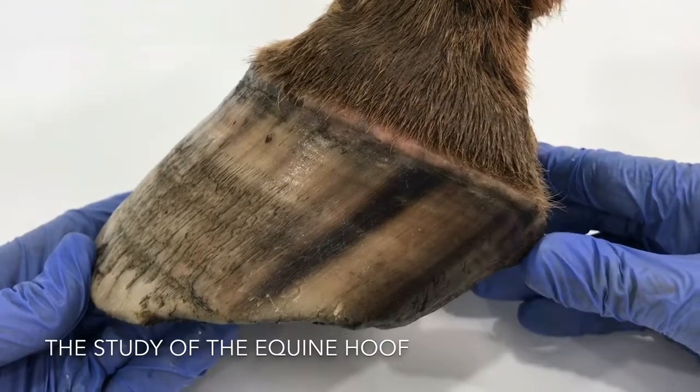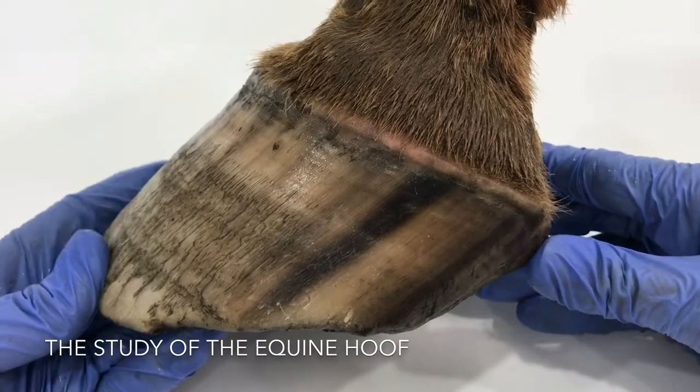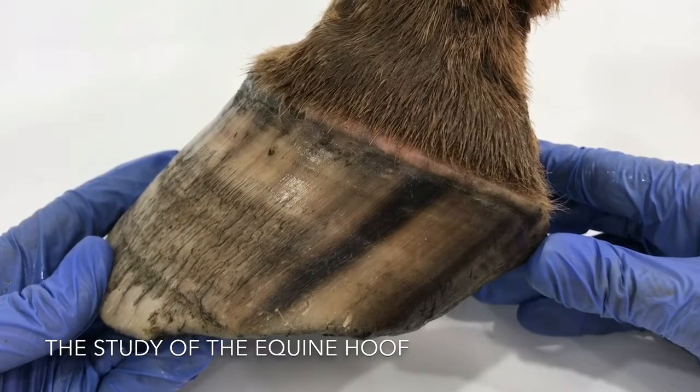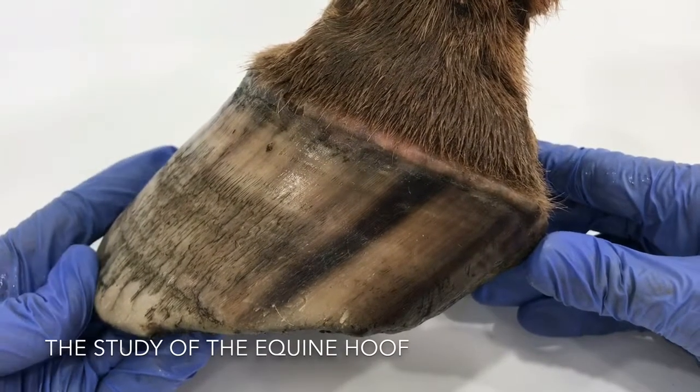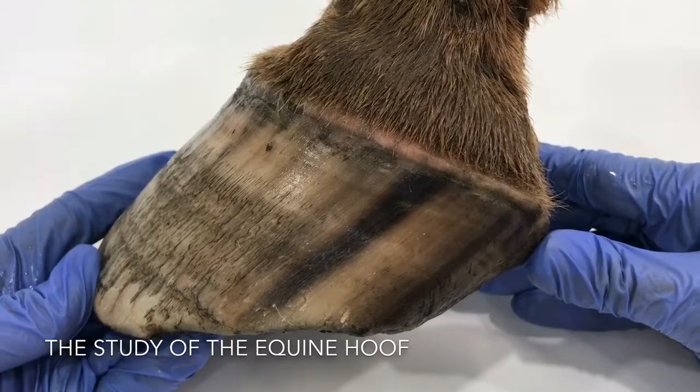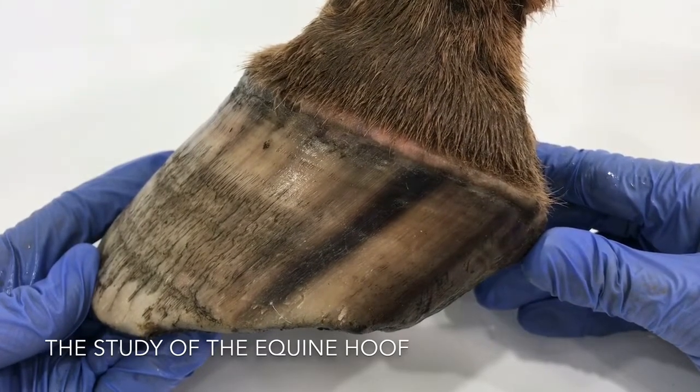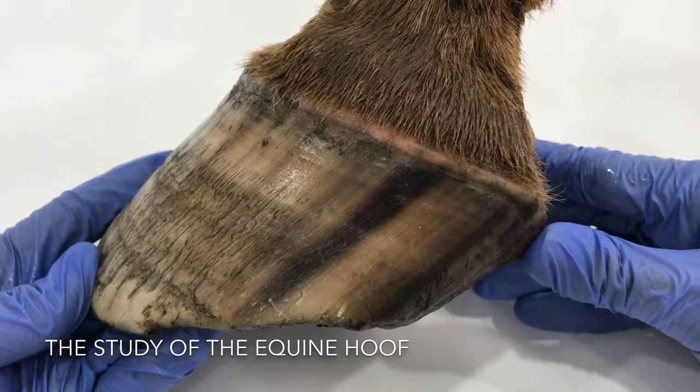Greetings from New Zealand, my name is Lindsay Field. This is a foot that we looked at at a dissection workshop on the 20th of October 2018. I'm going to go through all the external features with you, and in a subsequent video I'll go through all of the internal features.